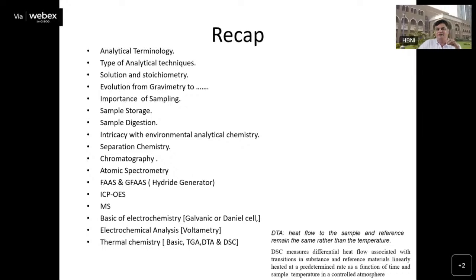And in the case of ion exchange chromatography, we have seen that there are various anion and cation exchangers. So depending on whether you want to separate the anions or cations, you can use various kinds of ion exchangers. See, basically in chromatography, both kinds of chromatography differentiate based on their mobile phase and stationary phase, and the various kinds of interactions between the various attractive forces.